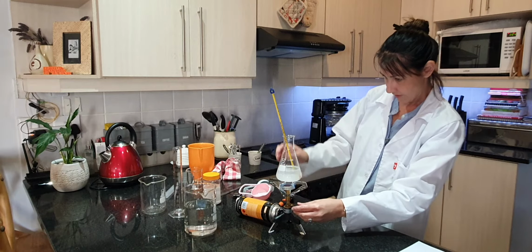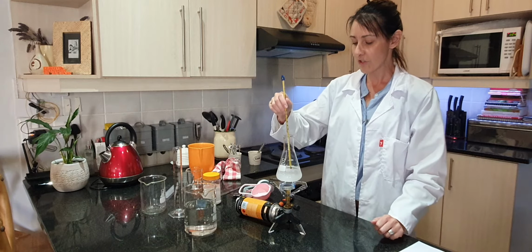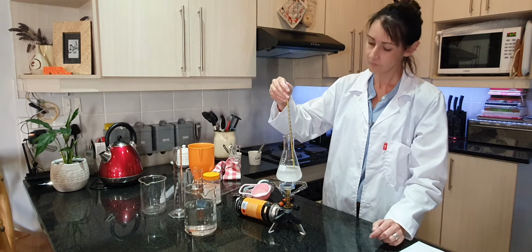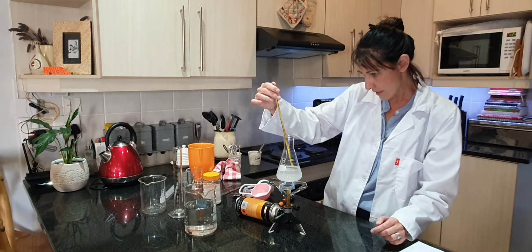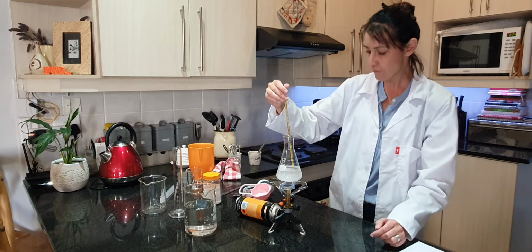Okay, bring the flame the same. Okay, and then once again stirring it a little bit, seeing if the temperature increases. Okay, so at the moment it is now up to 24 degrees.